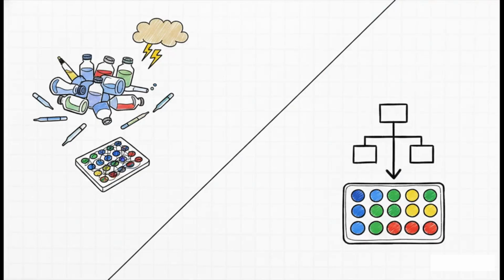Let's transition into how we apply this mindset right at the bench. Before you even set up a DOE, you have to stop the random plate-by-plate tweaking. You need to move to a structured decision tree and a truly data-driven workflow. If you are just blindly swapping blockers from the fridge, hoping the false positives will magically go away, you are going to waste weeks, if not months, of your life.